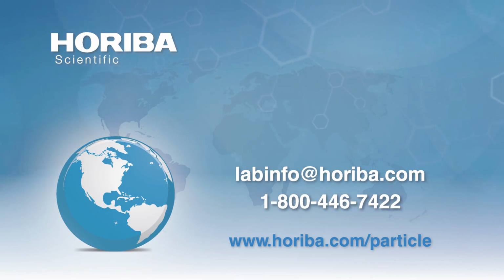One of the typical ones we would do is we would do two measurements. We would do one measurement where we look at typically the whole broad distribution. Then for another one, we would put in a more concentrated sample and totally ignore the large ones, only focus on the small ones, and in that way make sure that we actually saw those and had some idea how many of them were actually present in the sample.